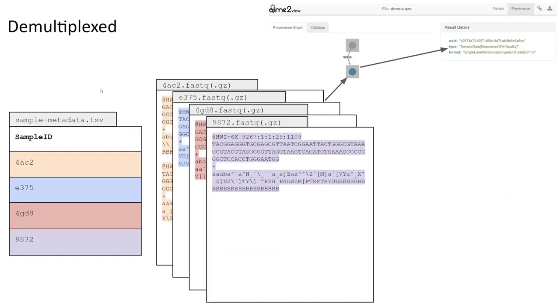When the demultiplexing process is complete, instead of having one FASTQ for all of our samples, we'll now have one FASTQ file per sample. And we no longer need our barcode file because we have already extracted information that we used from them. So, this is what we refer to as a demultiplexed file.